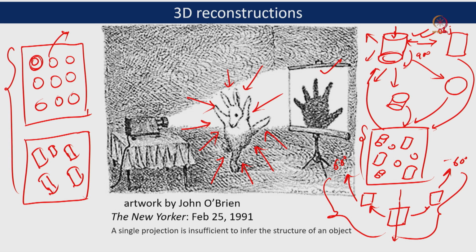So there are two ways. One is that we can use the single particles of this protein, where you have different orientations, and then we can calculate a 3D structure. The other way is that you will collect a tilt series at cryo condition, and then add them together and calculate a 3D volume. So if there are any tilt series missing, it is going to affect our 3D reconstruction. Now let's discuss that.